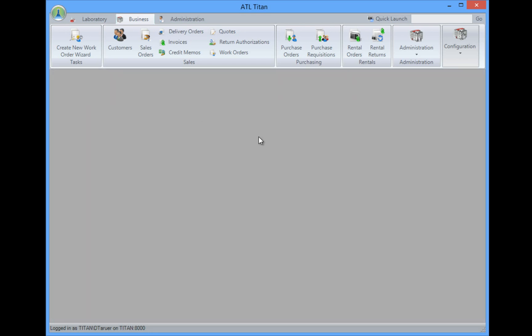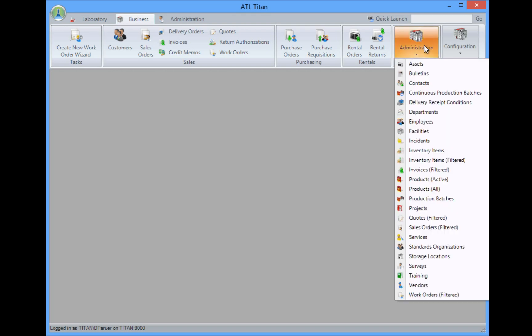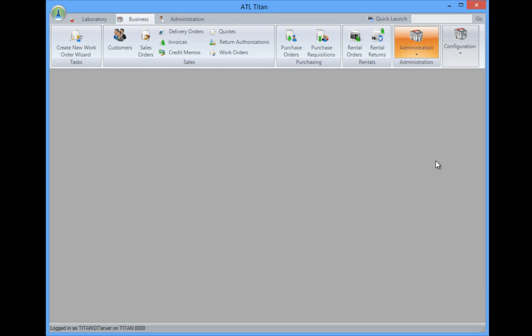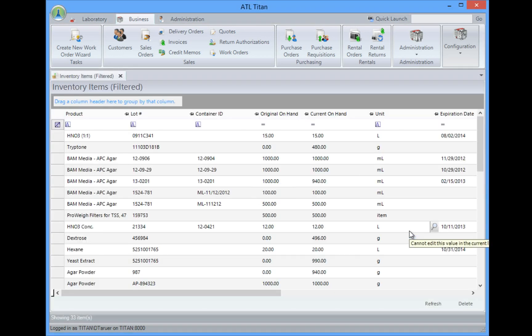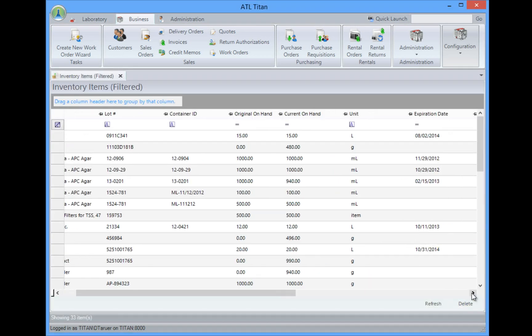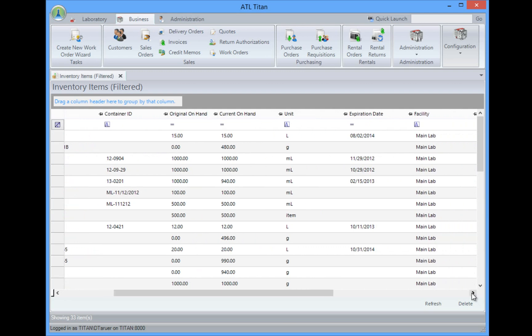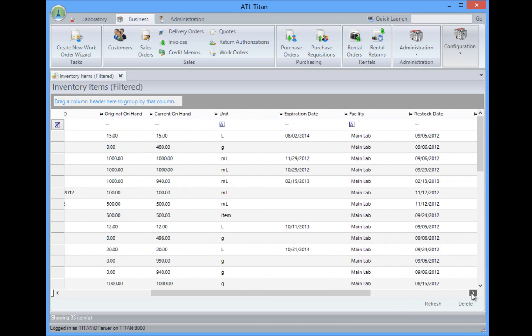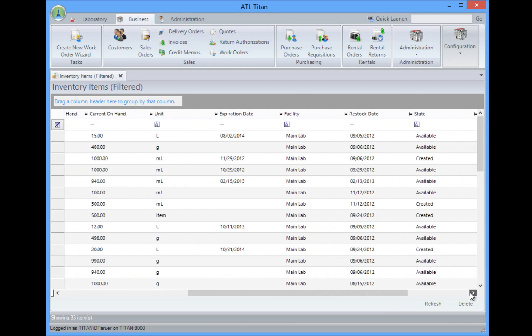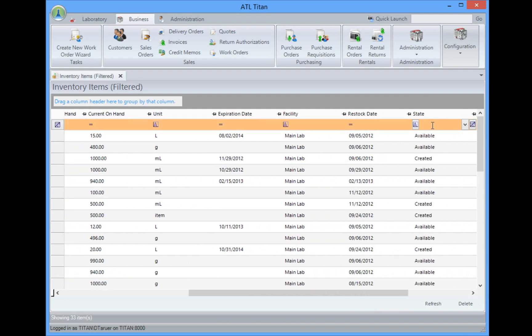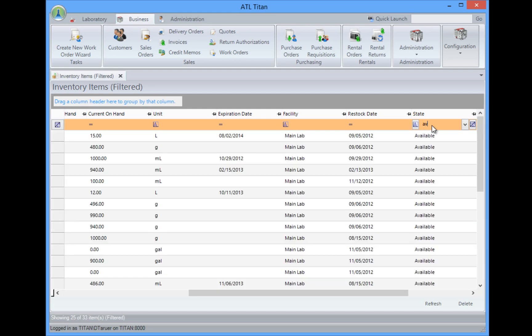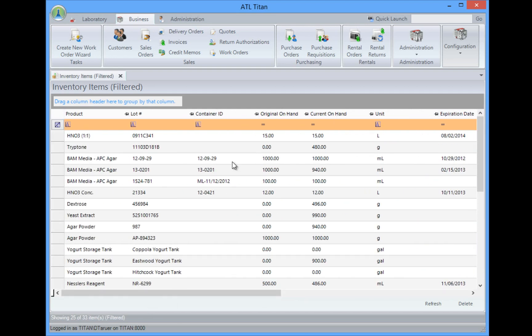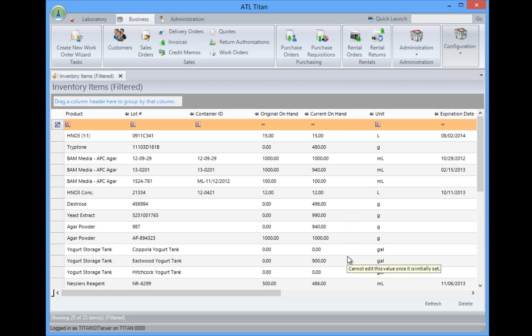So how does Titan track our inventory? Well, we can go over to the business area, we can take a look and we can look at our inventory items. And I'm going to open up this one, filtered and just unfiltered for everything. I could come in and maybe I want to see everything that's available and ready to be used. I can look at my state here and I can filter this by available. Now I can see a list of everything that's ready to be used in the lab and actually how much we currently have on hand for that.